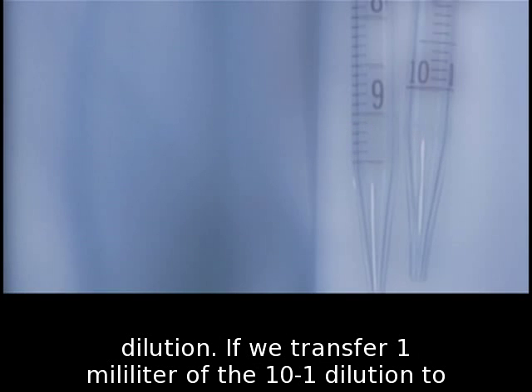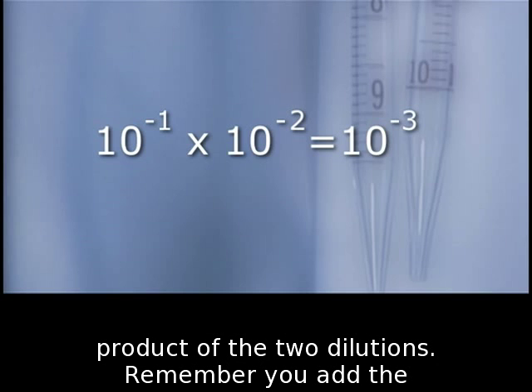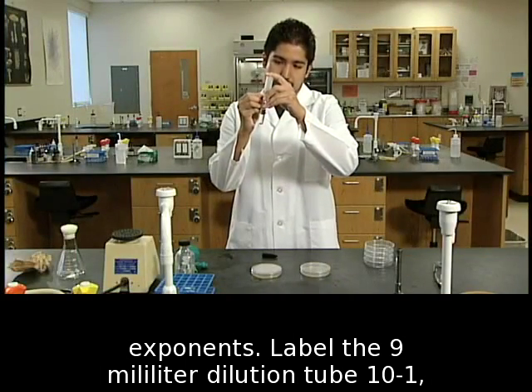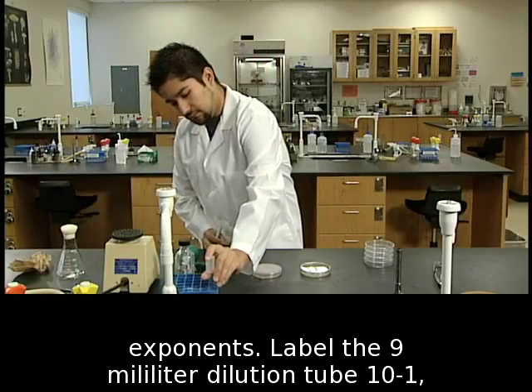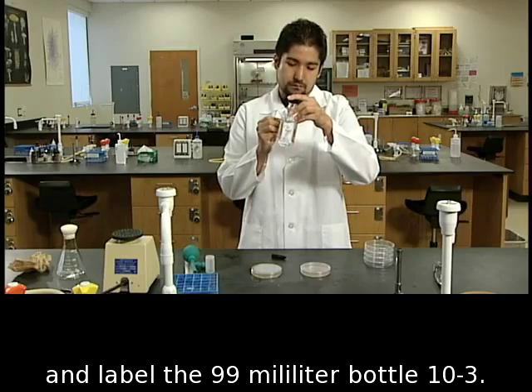If we transfer 1 milliliter of the 10 to the negative 1 dilution to the 99 milliliter dilution blank, the total dilution is the product of the two dilutions. Remember, you add the exponents. Label the 9 milliliter dilution tube 10 to the negative 1 and label the 99 milliliter bottle 10 to the negative 3.